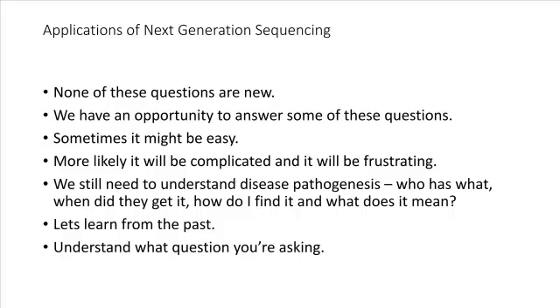If you think about this and have a specific question that you want answered, understand where you need to measure, who you need to measure, what kind of sample you need to take, then I think we'll make more progress and have less frustration with this new technology than we had when we first started doing PCR and virus sequencing.